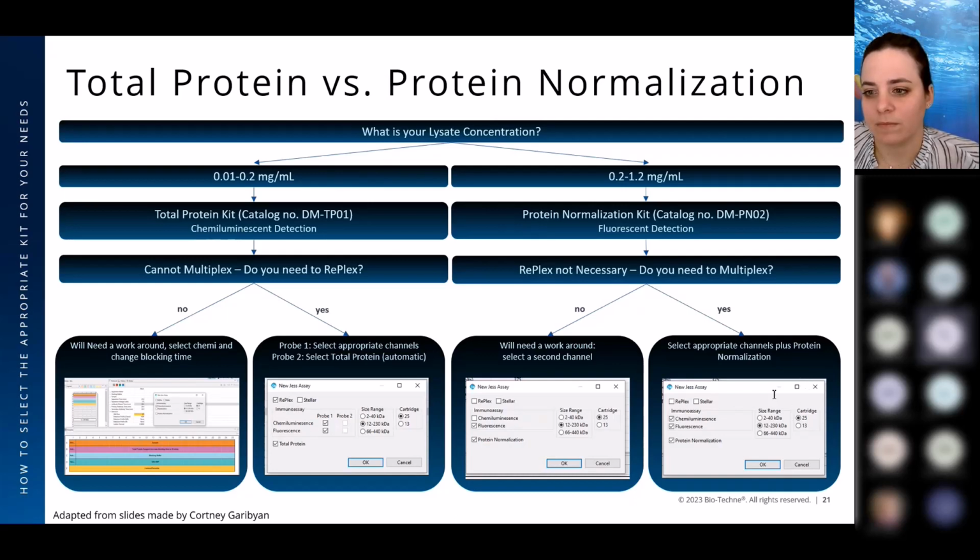But you have to spin down the plate for 5 minutes. Yes, so once you go through that, leave row B as the last thing you do, then go mix up the reconstituted lyophilized protein normalization labeling reagent. Dilute it as you need to, based on various concentrations, and then pipette it into the wells of row B, spin it, and then run it immediately. Okay. Well, that's basically what we're doing. Yeah, minimize the time at room temperature besides the spinning.